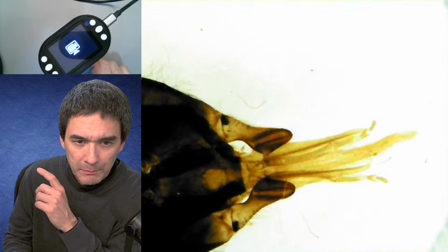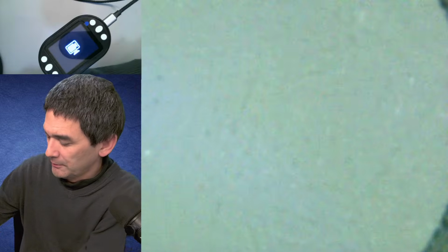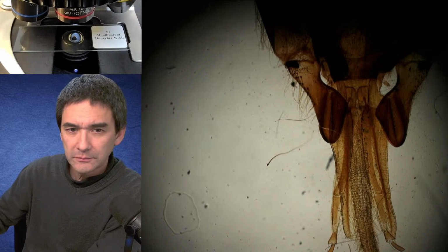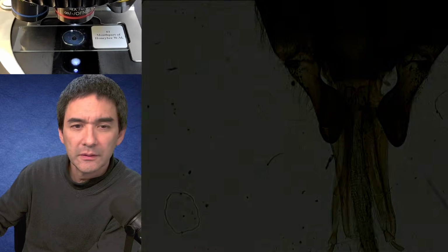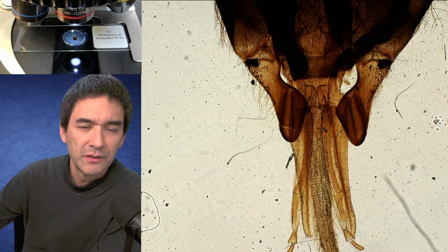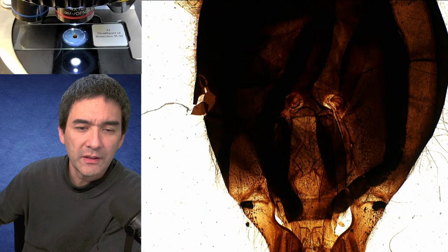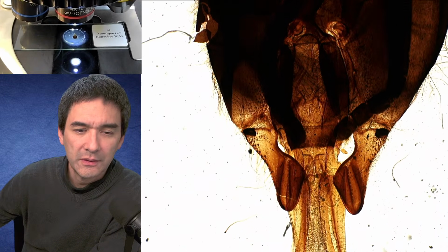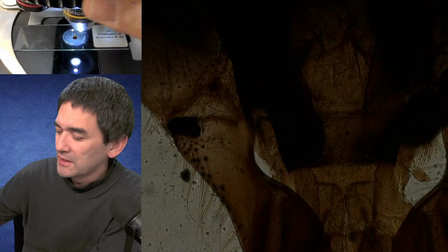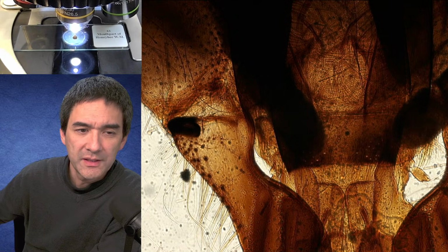So just in comparison, I'm going to show you how this looks under my real, in quotation marks, microscope. Okay. And of course, dynamic range and clarity and everything cannot be compared. I mean, obviously, what do you expect from a 29 euro device?